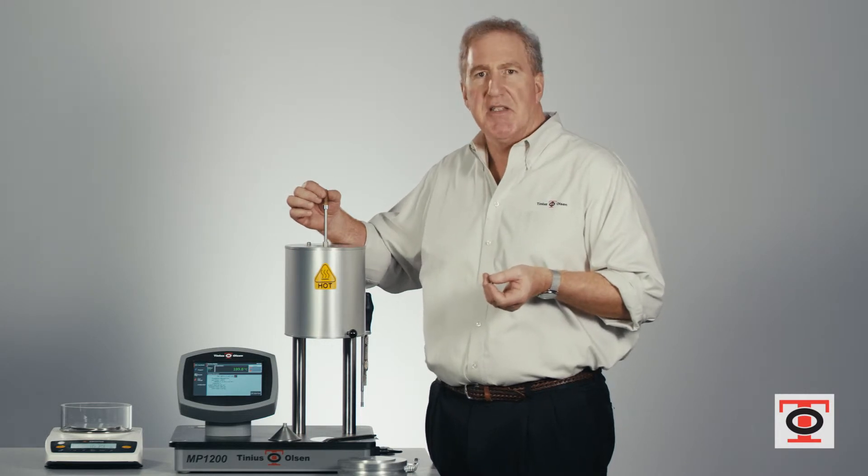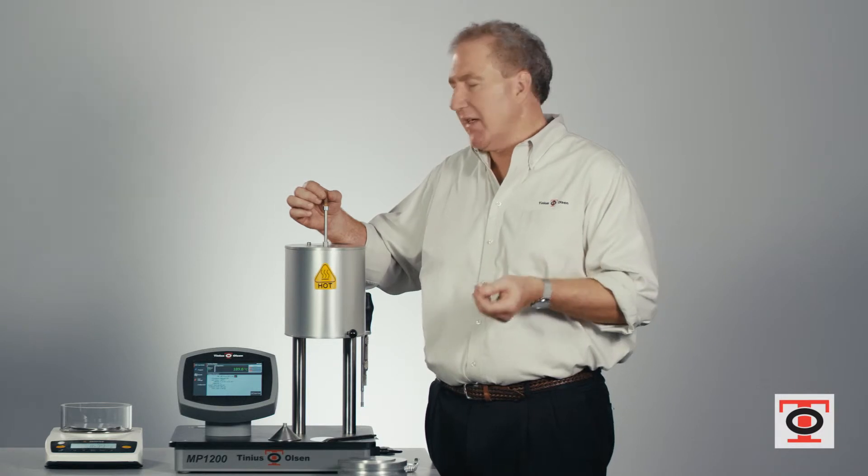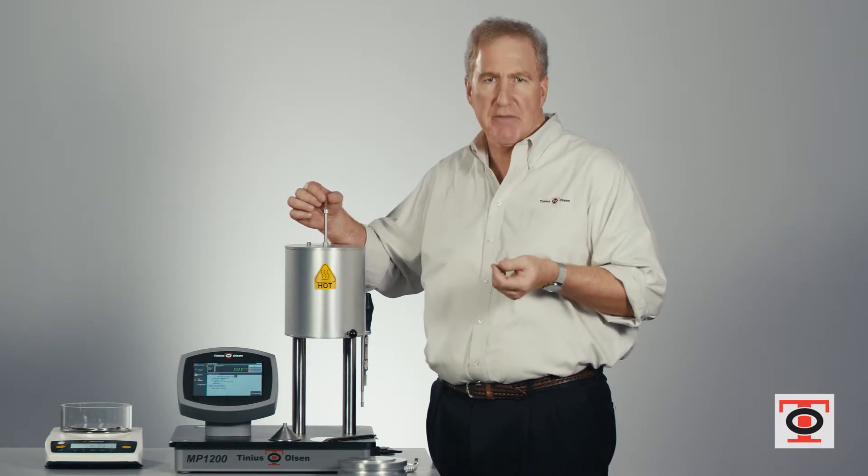Normally the capture time is about 60 seconds. You make that cut, weigh that piece after the 60 seconds, enter that weight into the MP1200, and the machine will calculate your flow rate for you.